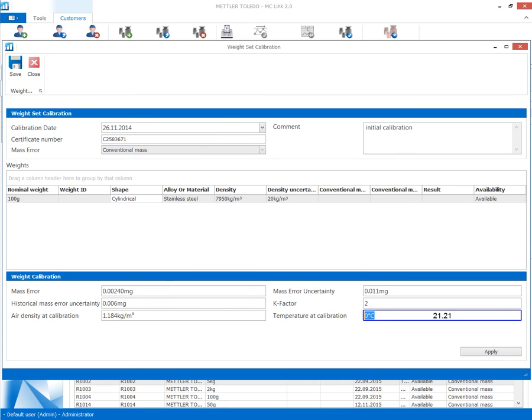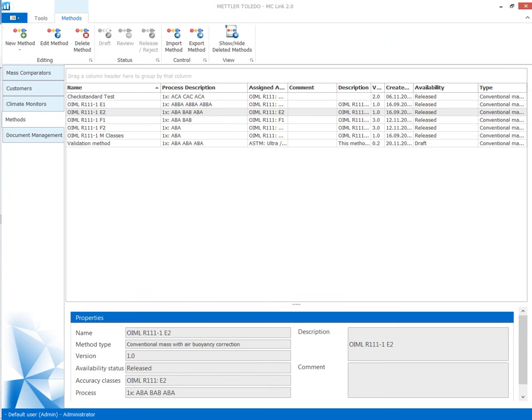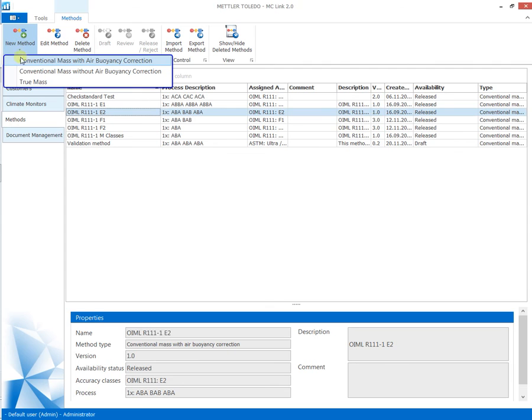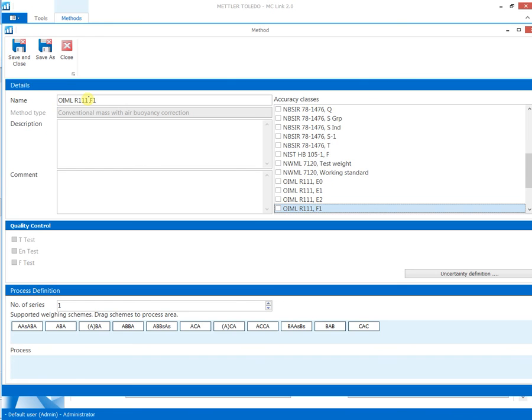The last definition is the mass calibration process. The initial selection of the mass family defines the available weighing schemes to build the process. The assignment of the accuracy class to the calibration process allows later filtering of the processes according to test weight accuracy classes.